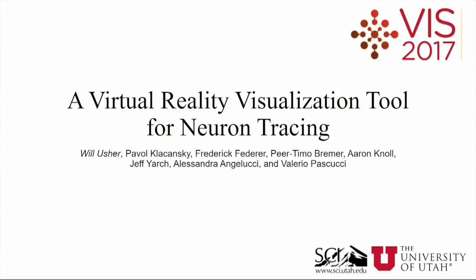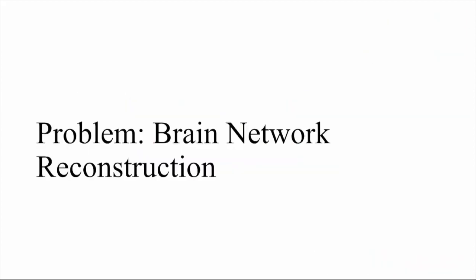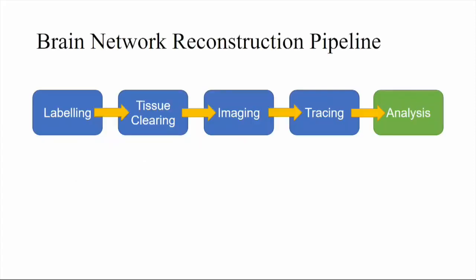In this talk, I'll be presenting our work on developing a virtual reality tool for neuron tracing. The task that we're trying to address is a critical bottleneck in the brain network reconstruction pipeline. In this work, we worked closely with collaborators in the neuroscience department. If we look at their pipeline, it's a typical pipeline for a connectomics laboratory.